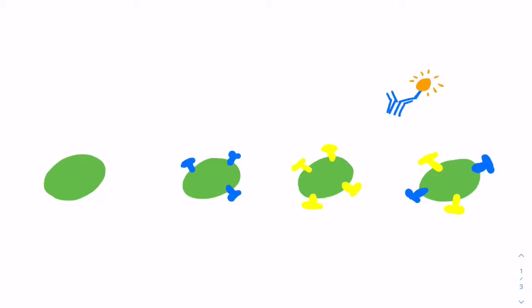I'm a fourth year student at Case within the Department of Nutrition, and today I'll be talking about flow cytometry. Here I have a number of cells, these are in green. Flow cytometry is a technique that is predicated on the idea of differential expression of not only intracellular molecules, but also cell surface molecules like the antigens shown in blue and yellow here.